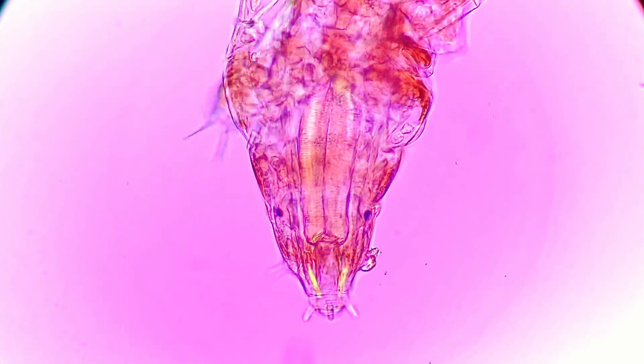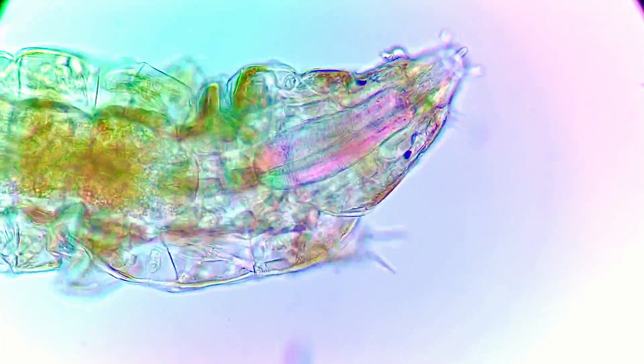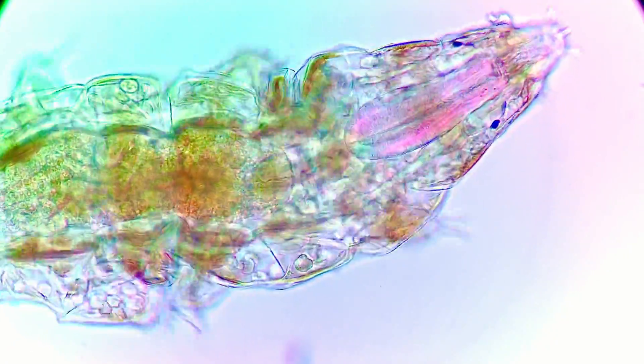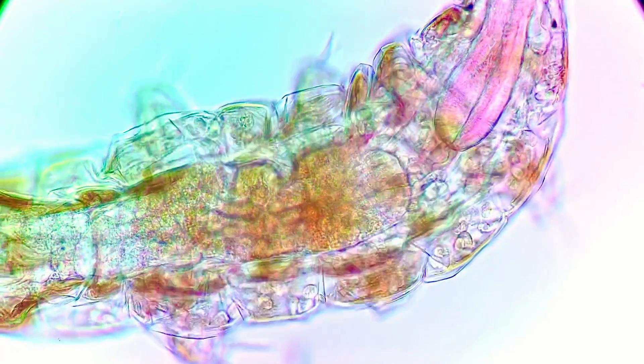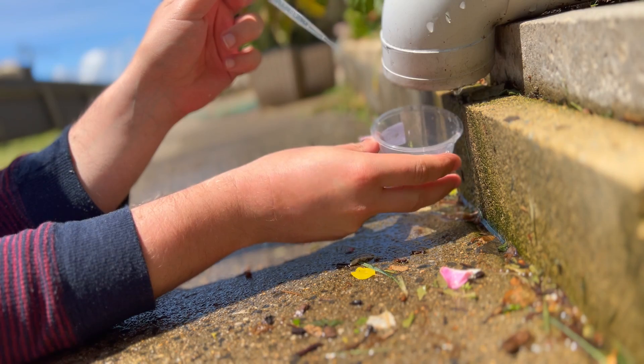I was lucky to find them because someone asked if I could look at muddy puddle water under the microscope. This is a beautiful creature, and it's time to put it back where I found it — back in the cracks and crevices of the brickwork, so that I can save it for another rainy day.